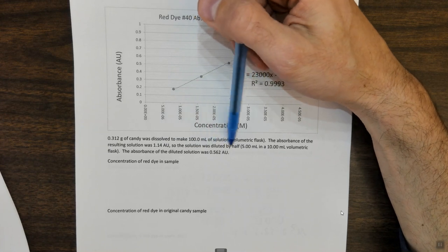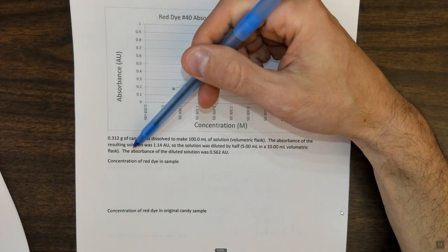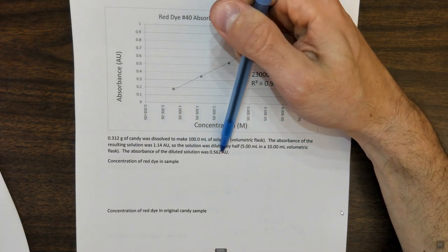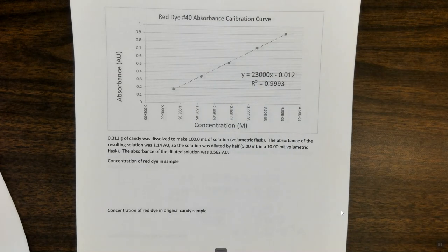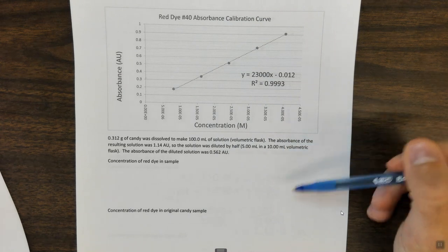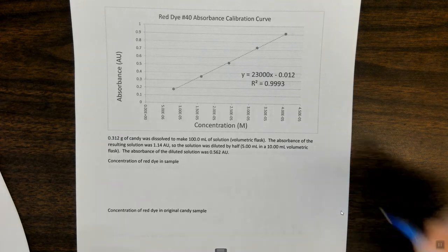So the solution was diluted by half, 5 milliliters in a 10 milliliter volumetric flask. The absorbance of the diluted solution was 0.562 AU. So a lot going on here. Again, don't expect you're going to have to do exactly these things. These are just the things that I'm doing to show you what's going on, but they're not the exact things you're going to need to do.